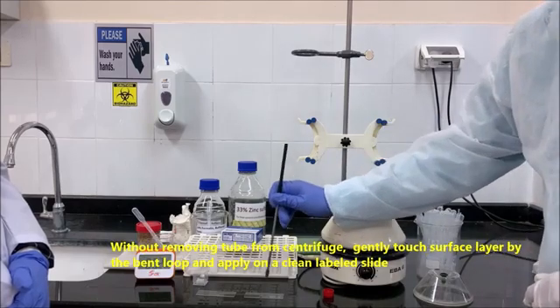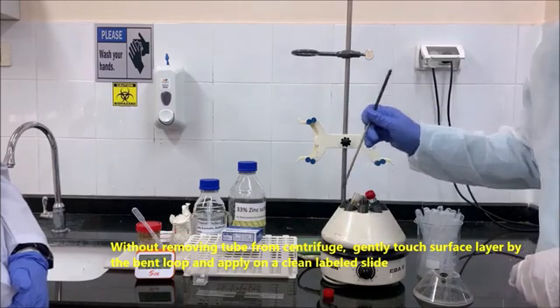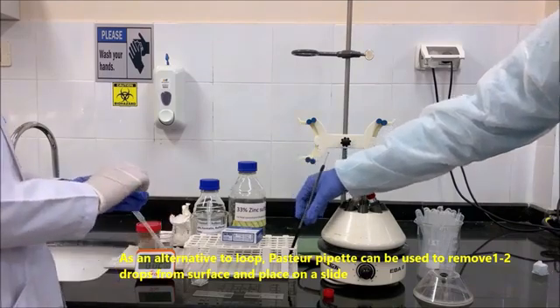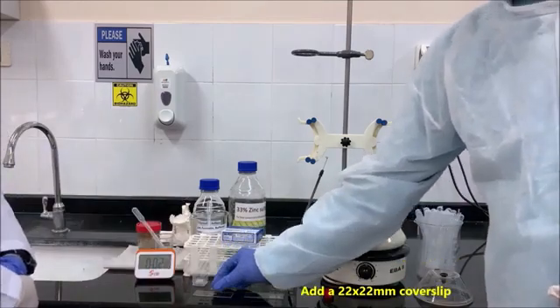Without removing tube from centrifuge, gently touch surface layer with a bent loop and apply on a clean labeled slide. As an alternative to loop, a Pasteur pipette can be used to remove 1 to 2 drops from surface and place on a slide. Add a 22 x 22 mm cover slip.